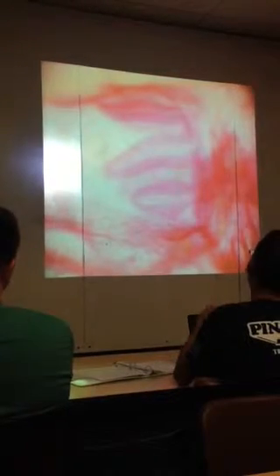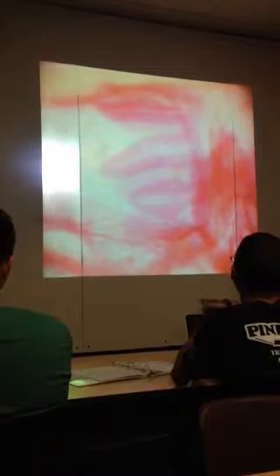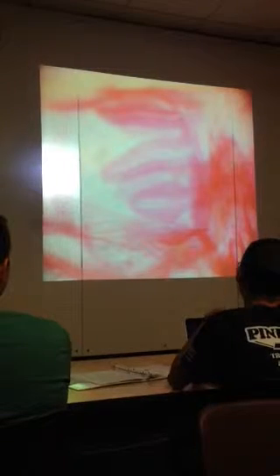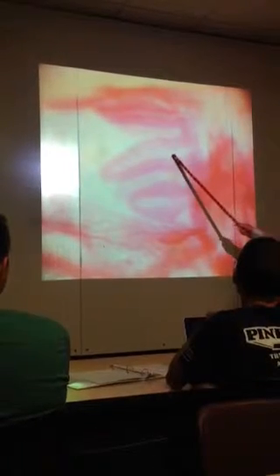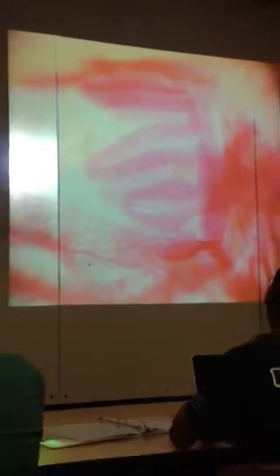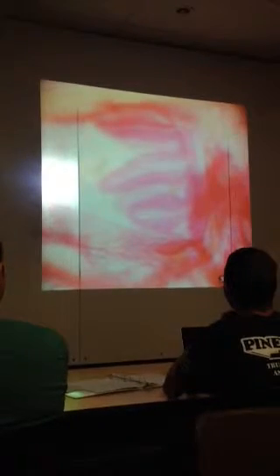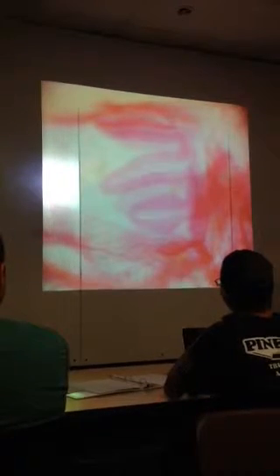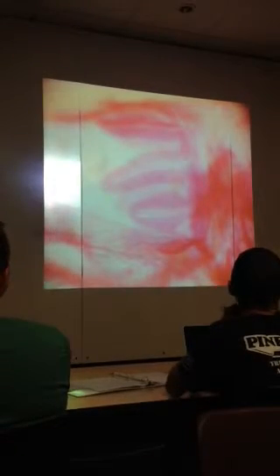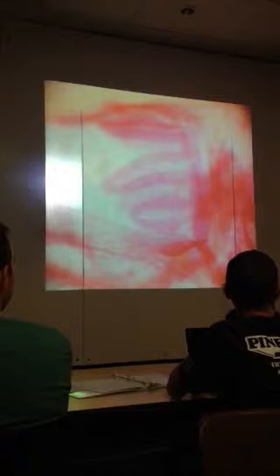High mag of the wheel organ, okay? Again, on the first day you'd be going, what the hell? I don't know why, but I look at it and it looks like little lightning bolts going through here. Maybe I'm just weird. Electrical charge, doesn't it? I could see turning that 90 degrees and making it into a painting on your wall. Anyway, that's the wheel organ. People walking out there looking and going, what the hell is that?